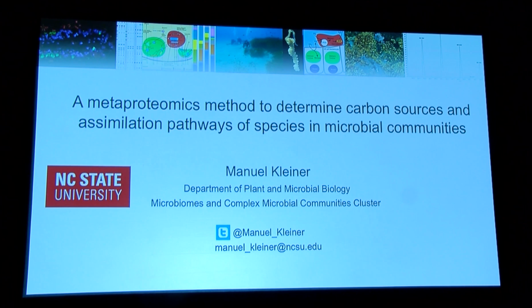So today I'm going to talk about one of our newest method developments, which is a method that allows us to look at carbon flow in microbial communities.